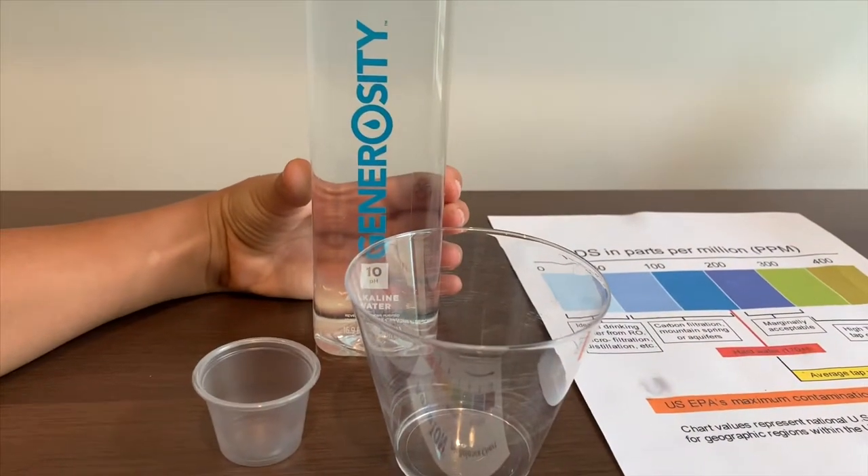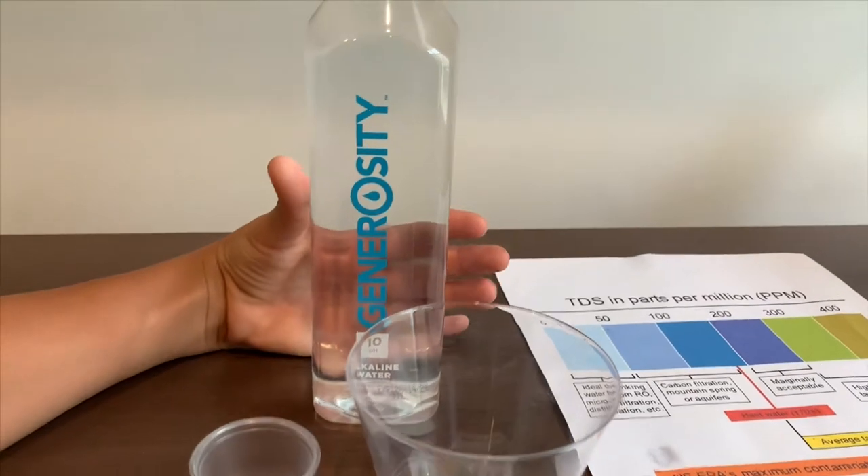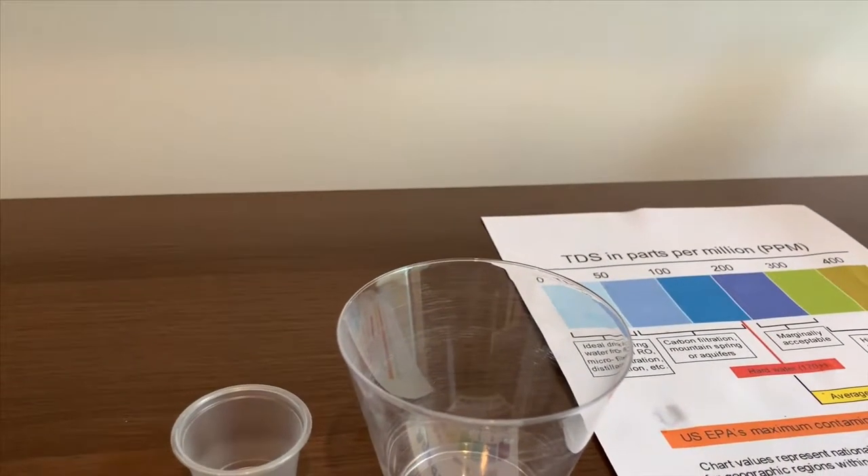This is Generosity Alkaline Water. It says this is supposed to be 10 pH. Let's test and see if they're right. Let's pour some in.